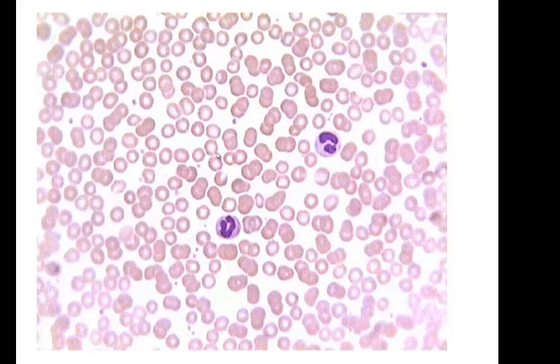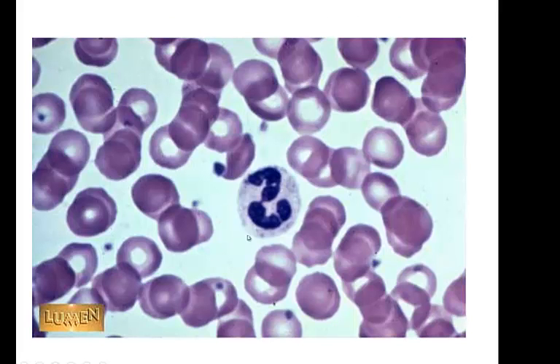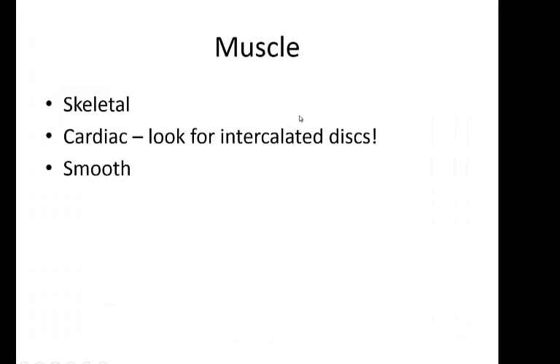and so that's a good thing. So in blood we have red blood cells, and we have little platelets. That's a platelet. Platelets are for clotting. Red blood cells carry oxygen. And then we have white blood cells that stain up really nice and pretty for immunity. And so those are our cell types. So this is what blood looks like. It doesn't look like anything else, so I hope you don't miss blood on the practical. And there's blood up close. Here's our white blood cell and our platelet and our red blood cells.